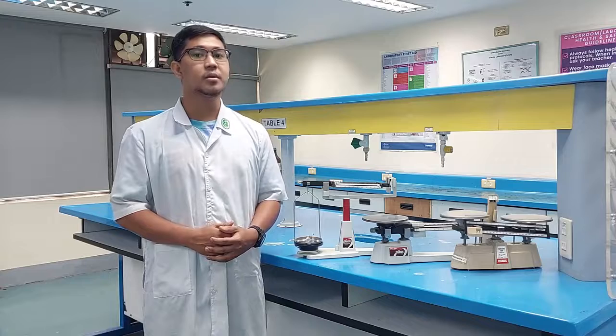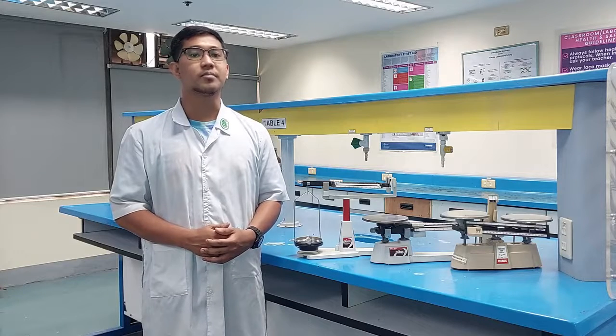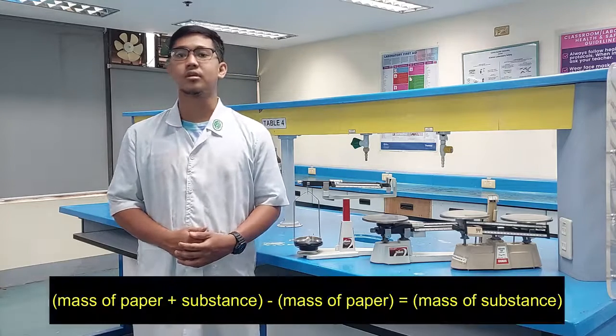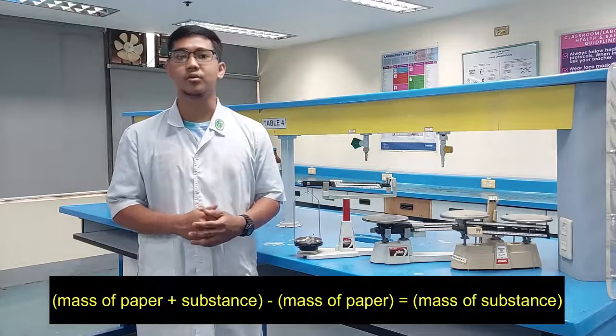A clean piece of weighing paper or weighing vessel is placed on the balance and weighed. This is the first reading. The substance to be weighed out is then placed on the weighing paper and weighed. This is the second reading. The mass of the substance is determined by subtracting the first reading from the second reading.